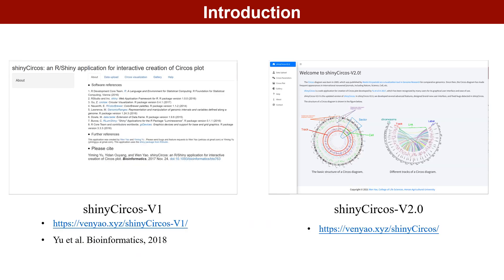ShinyCircos v1, developed in 2017, is a web application for creating Circos diagrams online, which has been widely recognized for its graphical interface and ease of use. Since its release, ShinyCircos v1 has received a lot of user feedback, including bug reports and new feature requests.